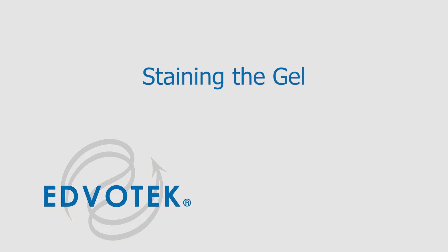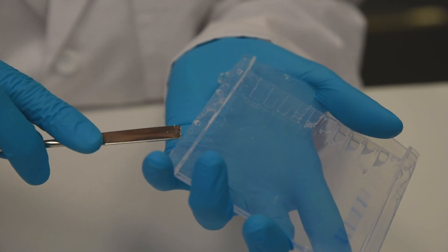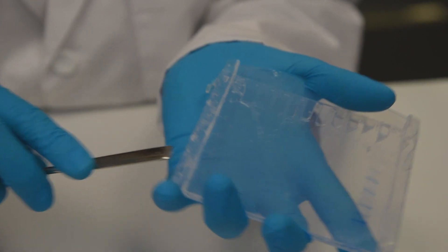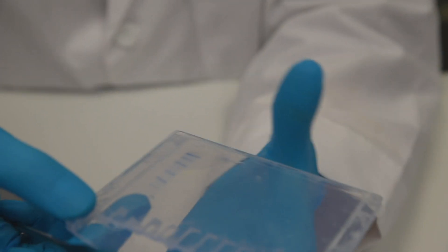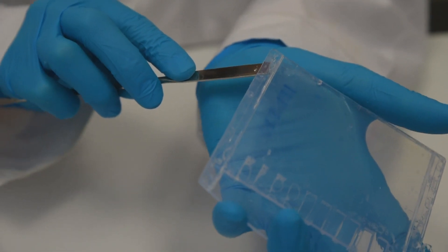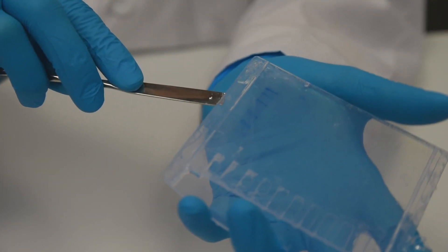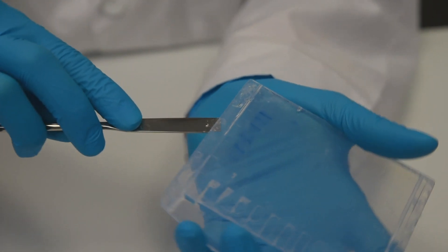Staining the gel. Step 1: After electrophoresis, lay the cassette down and remove the front plate by placing a thin spatula or screwdriver at the side edge and gently lift it away from the larger back plate. In most cases, the gel will stay on the back plate.